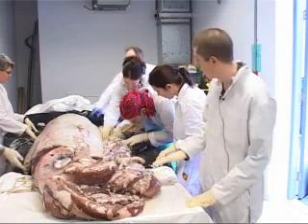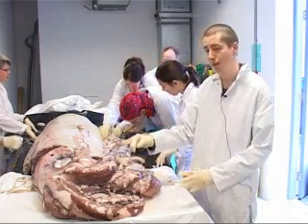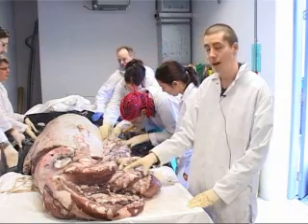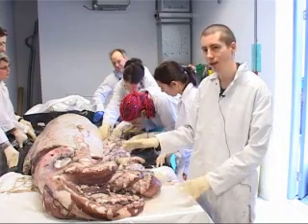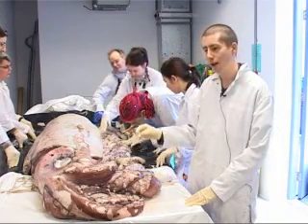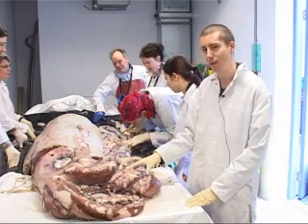At the moment, we're just trying to free the last bit of ice off the specimen, so it's not as easily damaged when we move it. A bit later on, we'll be unrolling it across the length of the tank room, doing some measurements of all the different parts, and then fixing it with formalin so that we can put it into its final bath of formalin to preserve it. That'll take about a month.